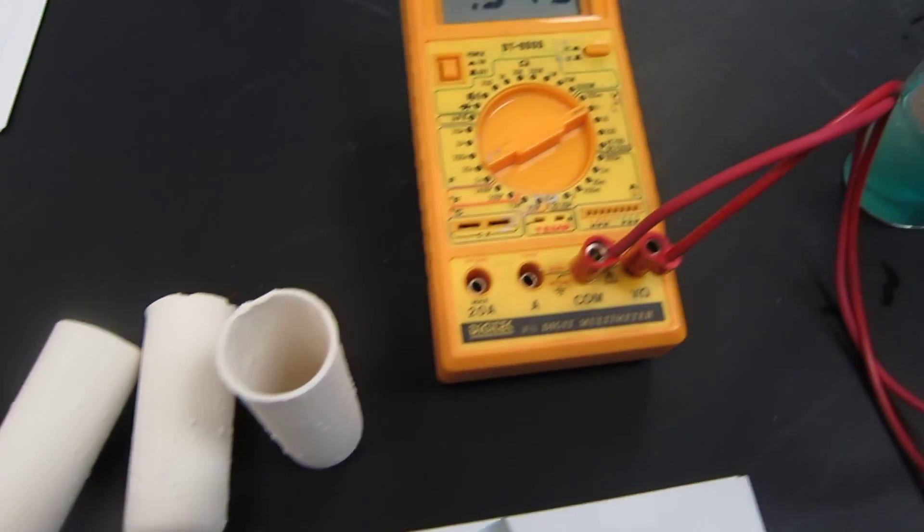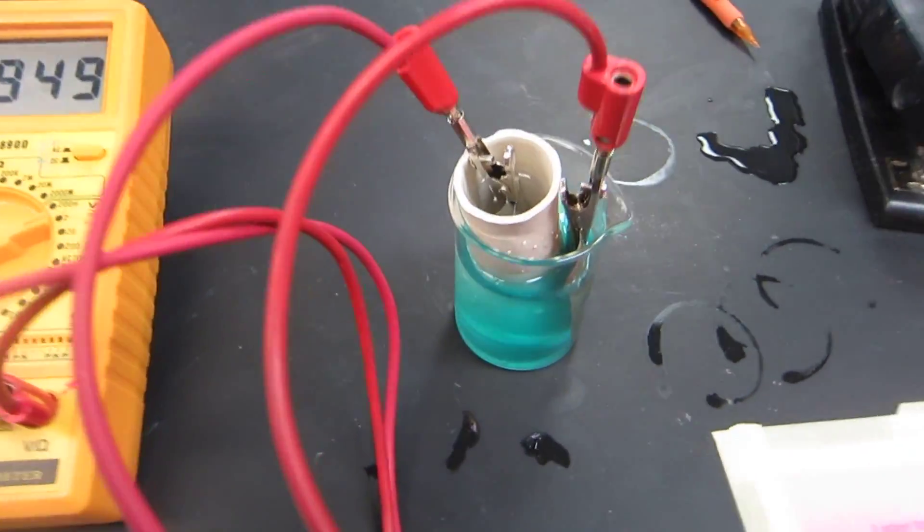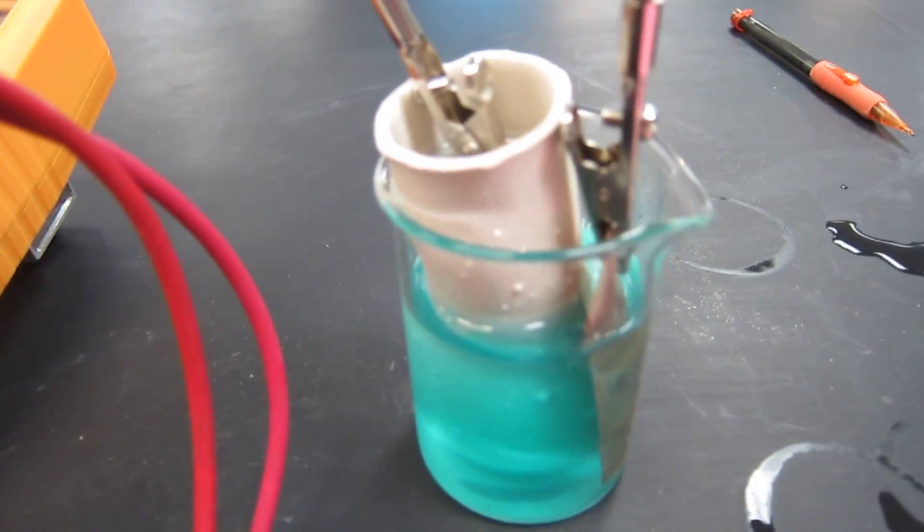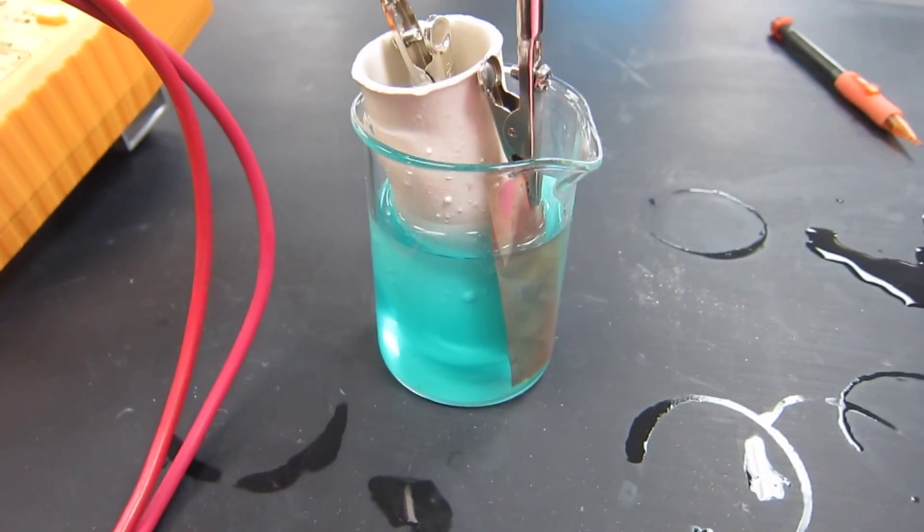The reagents required for this experiment are zinc sulfate, which should be 1 molar concentration, and you add it into the porcelain cup which holds the zinc electrode. This is the anode.